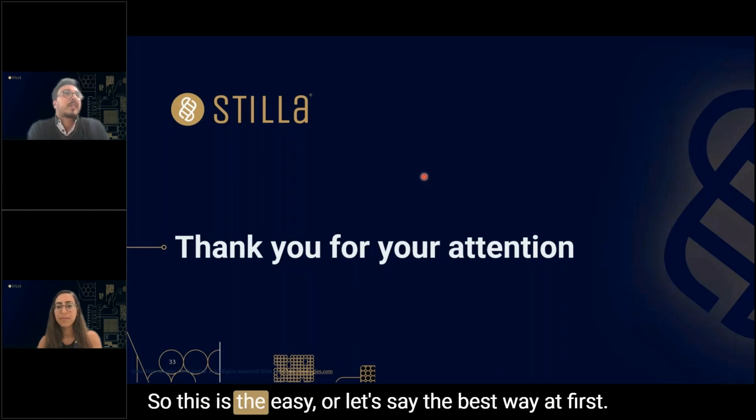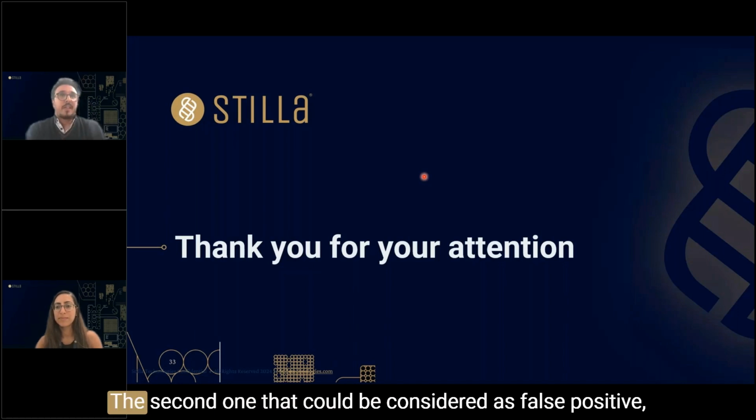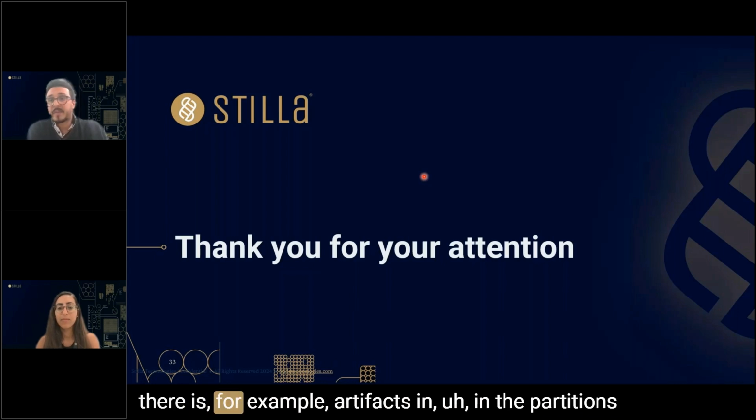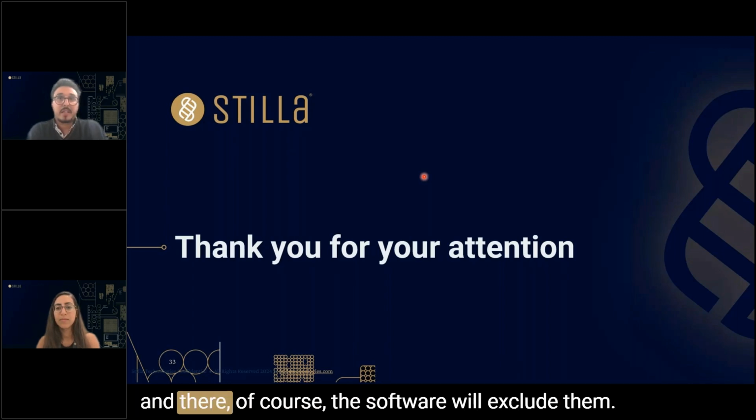So this is the easy, or let's say the best way at first. The second one that could be considered as false positive, and this we sometimes come across, is when there are, for example, artifacts in the partitions. And there, of course, the software will exclude them.